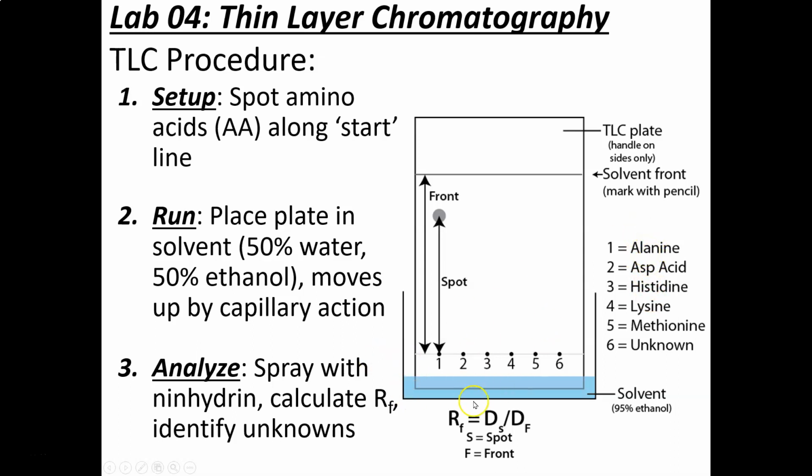All right, and then once you let them spot, it usually takes a couple hours, minimum an hour and a half. You can probably go a lot longer. You never want the solvent front to reach the end of the plate. As long as it was far enough where you could expect separations from the different spots, and it didn't reach the top, you'd be fine. And usually in laboratory situations, it's about an hour and a half, up to 3 hours.